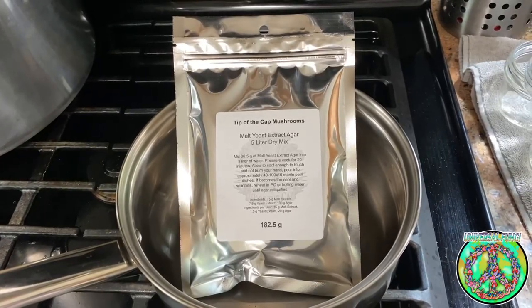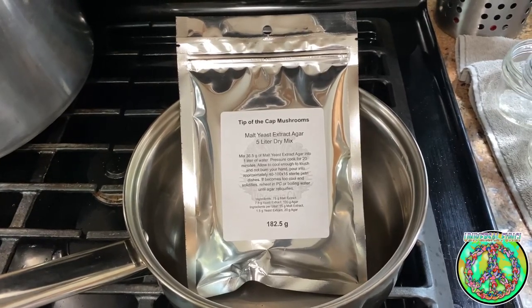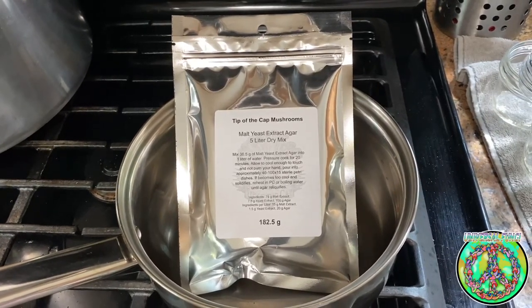Hello Universe! Universal Fungi here and in this video I'm trying out the No Pour Agar Tech.